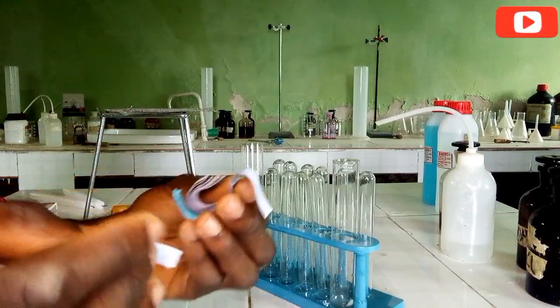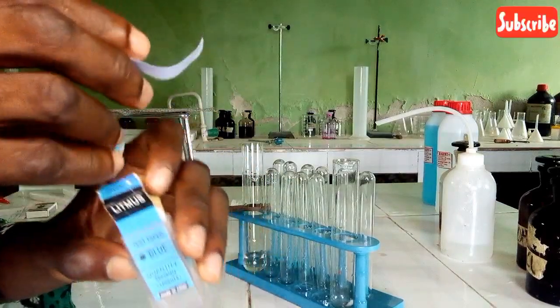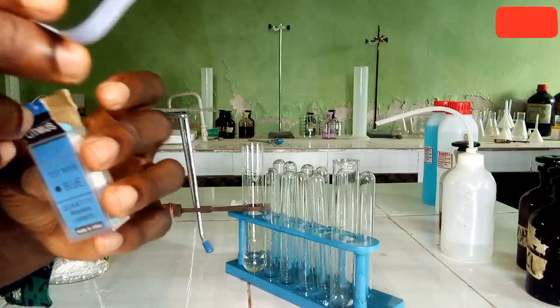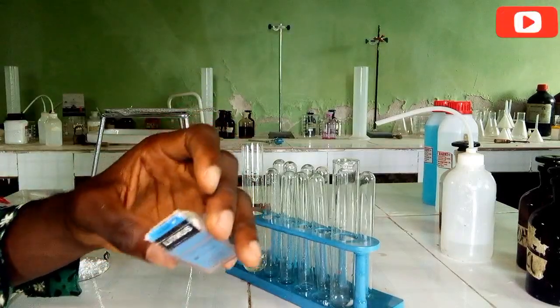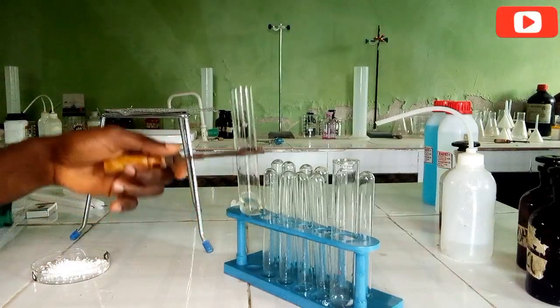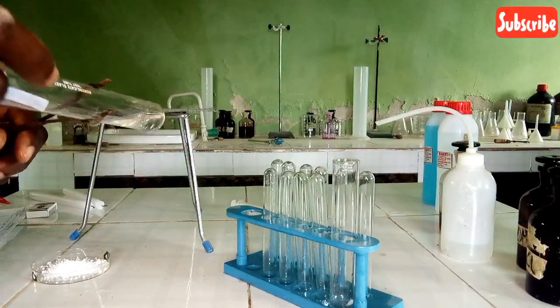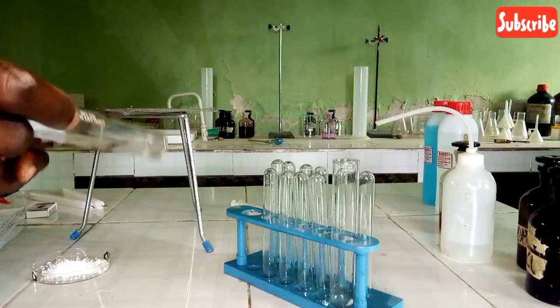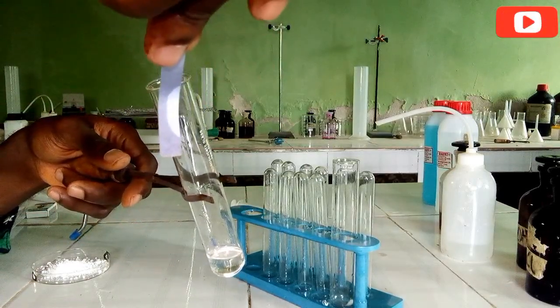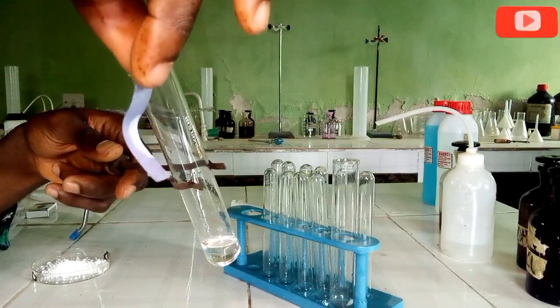So I'll cut my litmus paper. This is blue. Endeavor that your hand does not contain any acid or base that will change the color of the litmus paper before you test it. So let's test the solution with it and see the changes that may occur. If you look at it, as I dip it in, there is no change at all. It still remains blue. So the solution is not acidic.